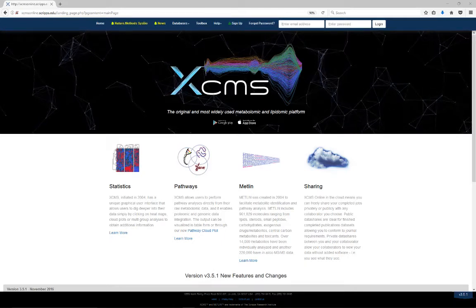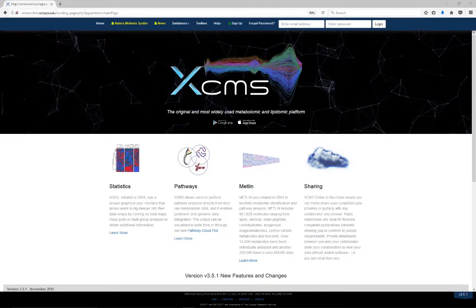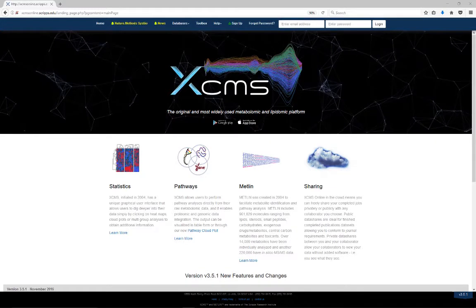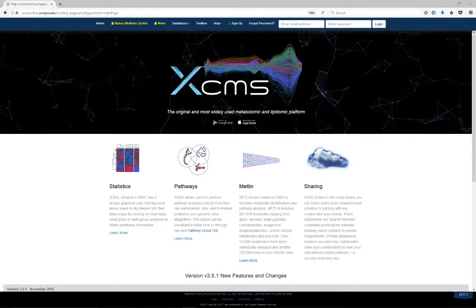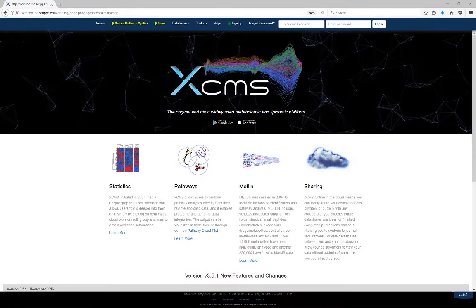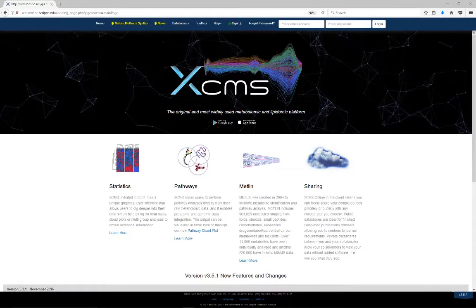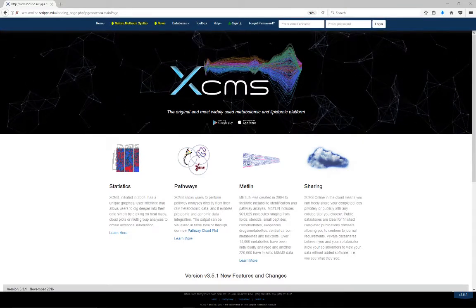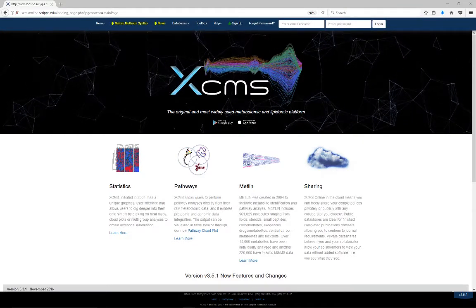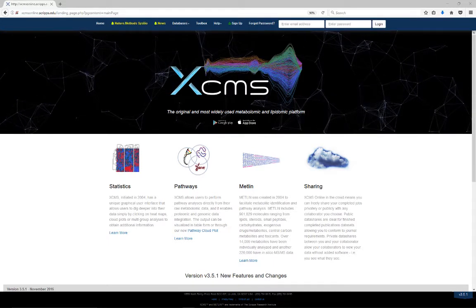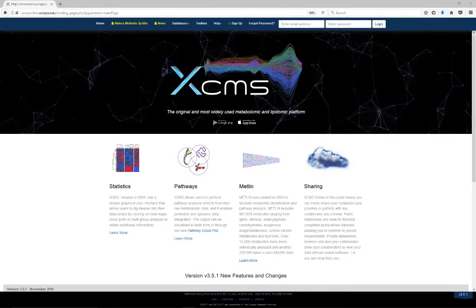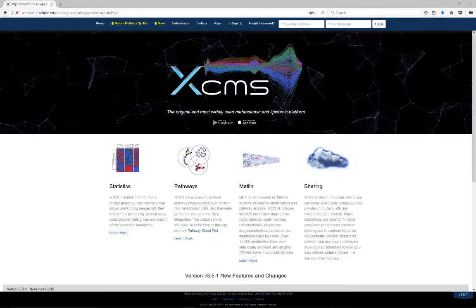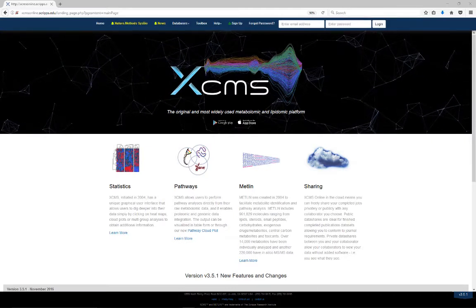Hello, XCMS Online now provides a systems biology platform that allows you to directly map raw metabolomics data onto biological pathways and subsequently perform multi-omic integration using transcriptomic and proteomic data. This video is made up of two parts: pathway analysis and multi-omic integration.